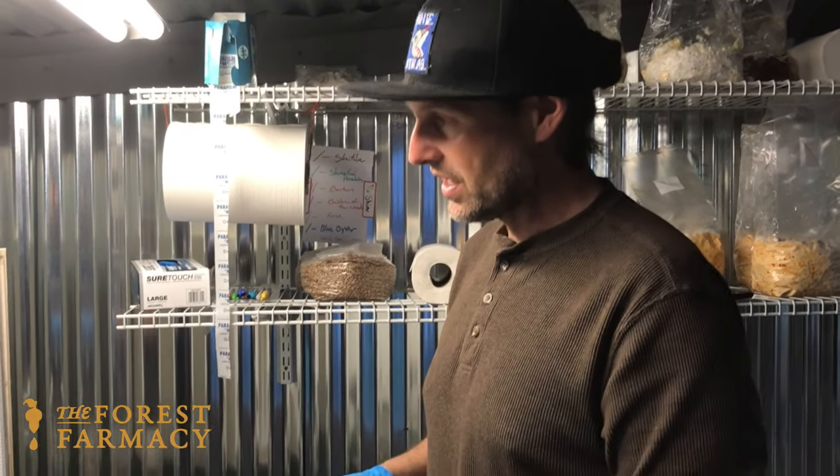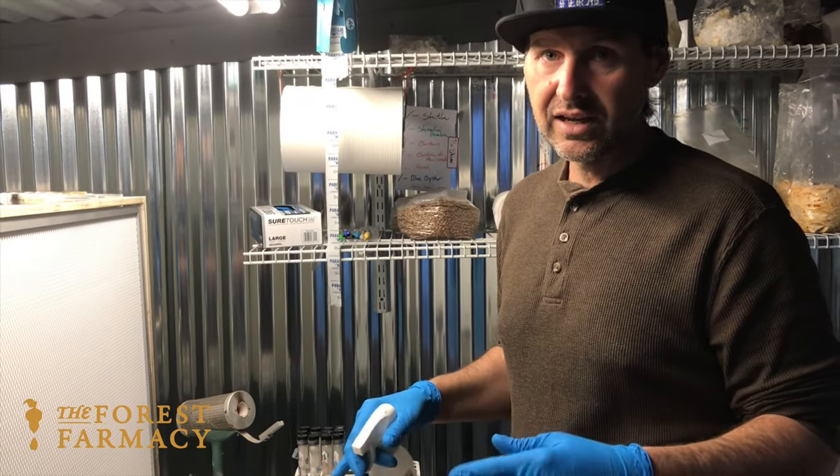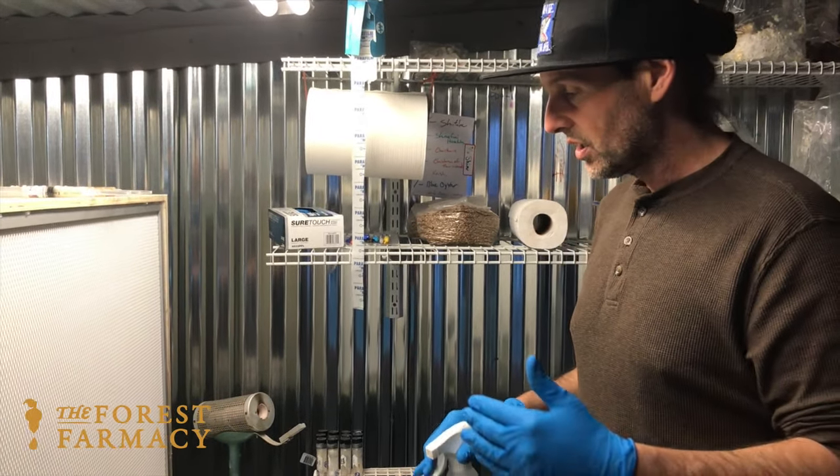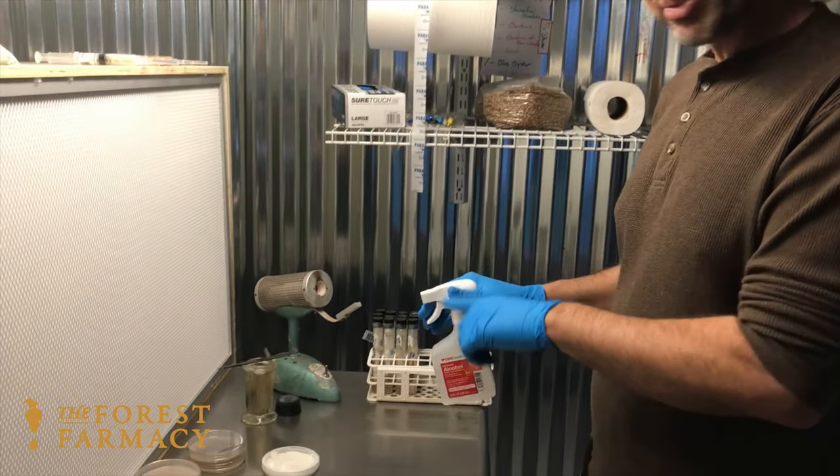Hey everybody, it's Christopher. We're here at the Forest Pharmacy and today it may be a little bit loud because the flow hood is running, so I'm going to talk loud. Today I'm going to do some plate-to-plate transfers in the lab here.